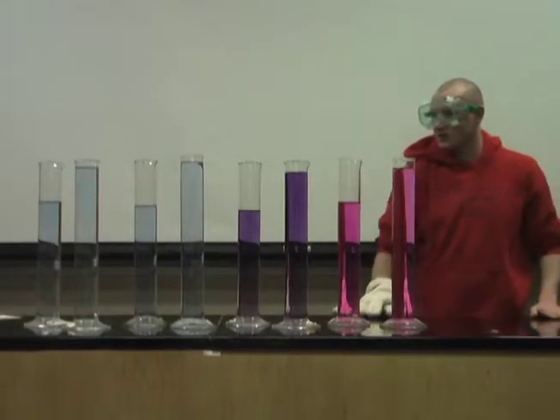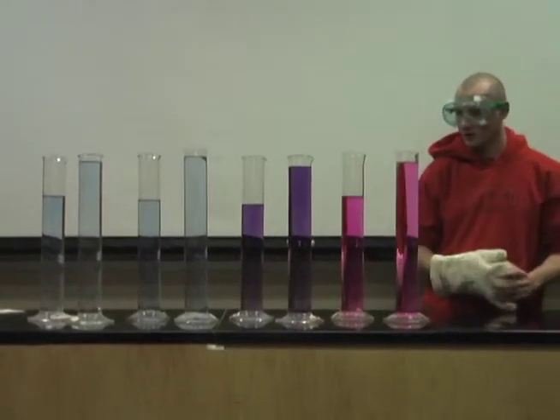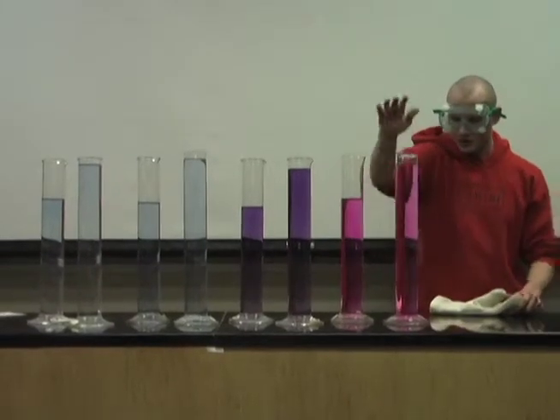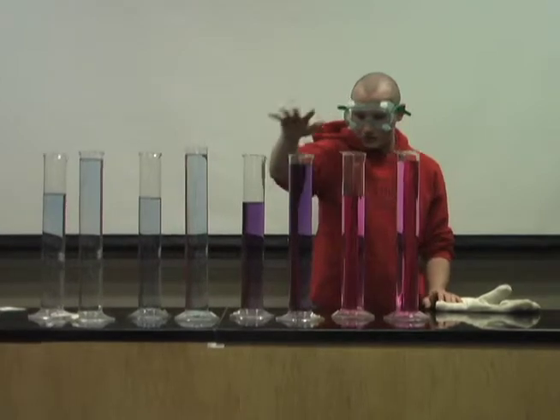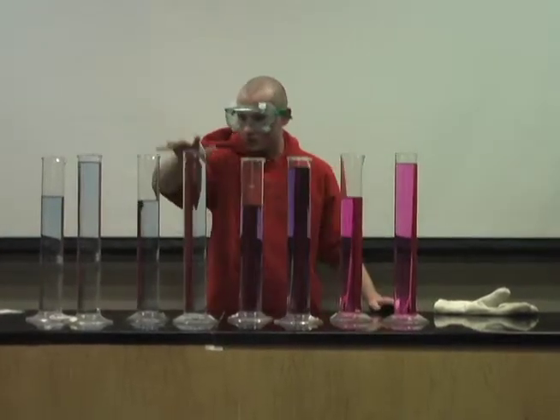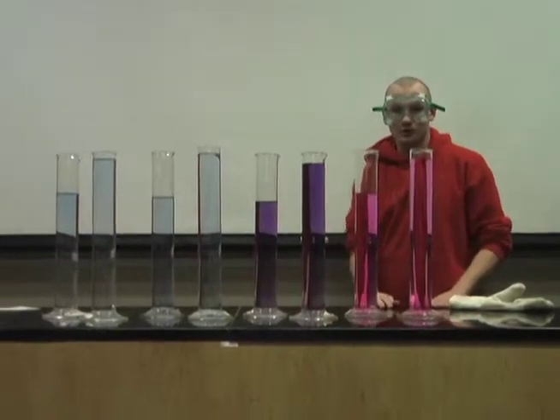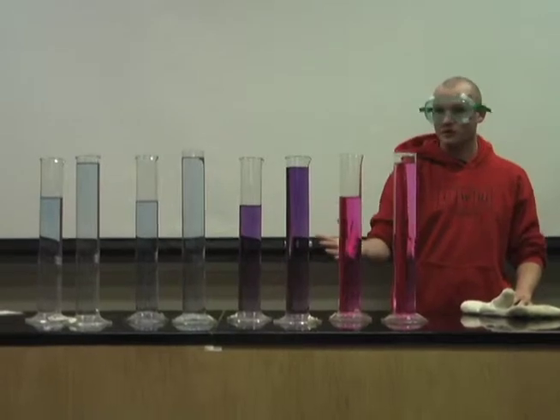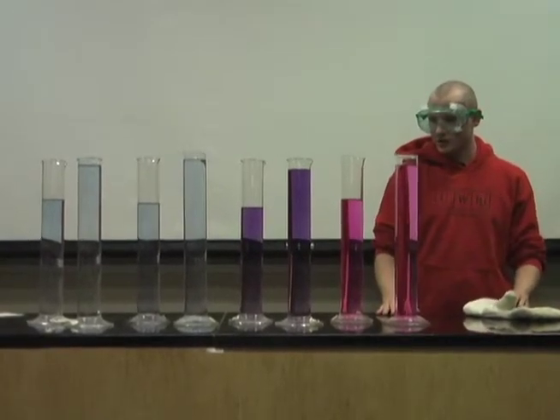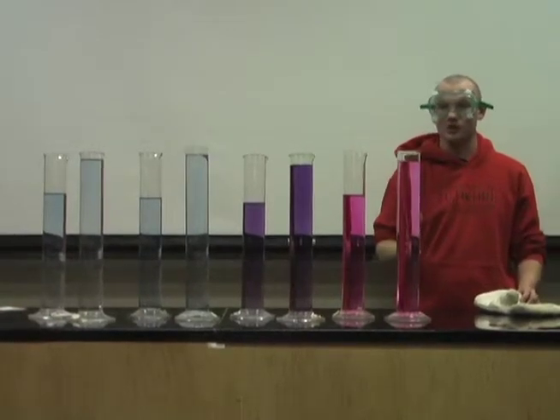So what we have here is 8 graduated cylinders filled with different indicators. Here we have universal indicator, phenol red, universal, thymol blue, and thymolphthalein. A pH indicator will indicate the pH, obviously. Right now we have them all basic, so they all show a basic pH. As the pH changes, the color of an indicator would change.